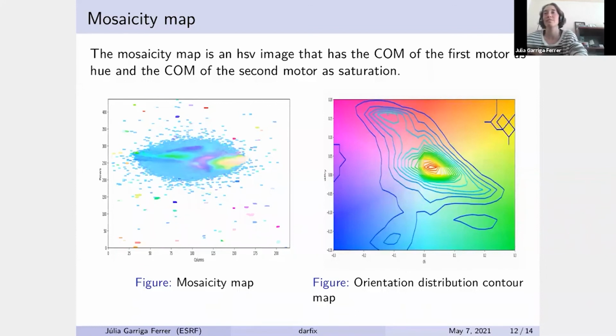Julia, that was for another session. Yeah, right. Was it? Okay. Actually, Mats can answer the question. Okay. Yeah, I see. It somehow came back. Yes, Mats can answer the question because that is directly relevant to the Fourier ptychography analysis that he has done.